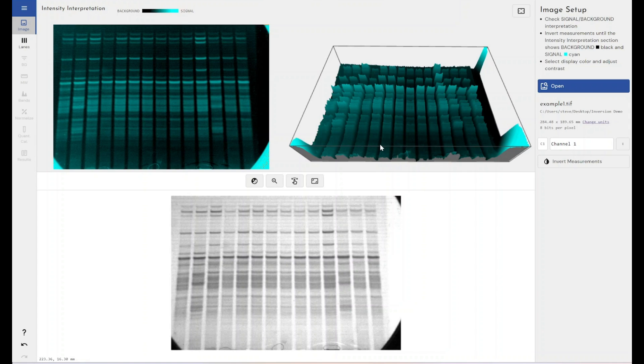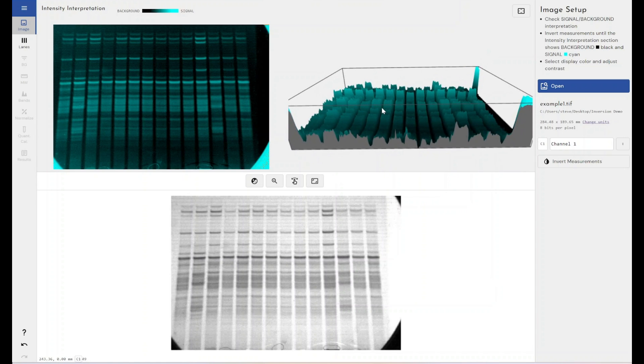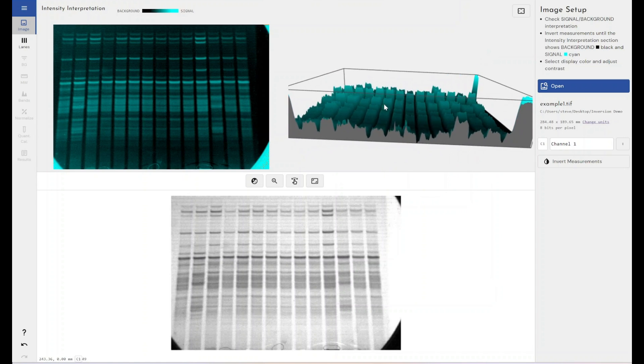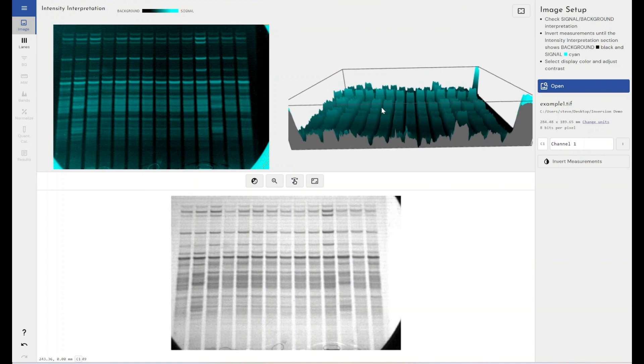Because if you had this example and you inverted everything, you would end up with your troughs again, and your data would not be very accurate. It would not feed in well to the algorithms that we have for automatic lane detection, automatic band detection, and things like that.